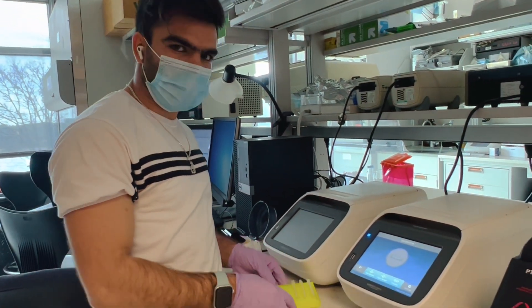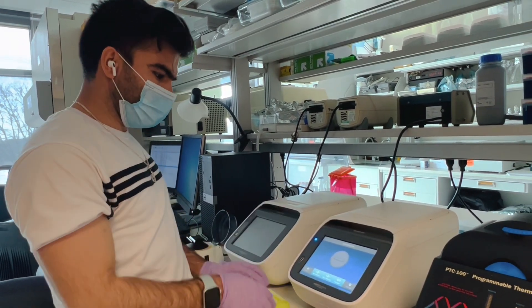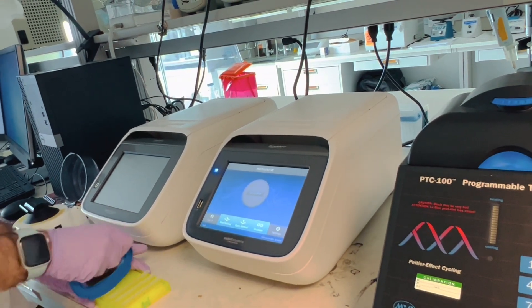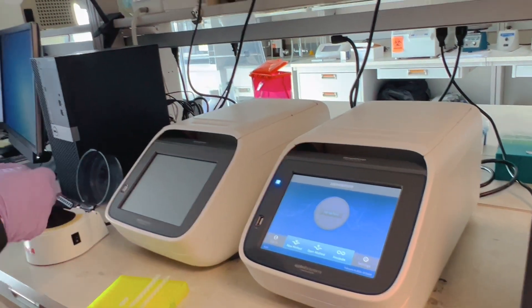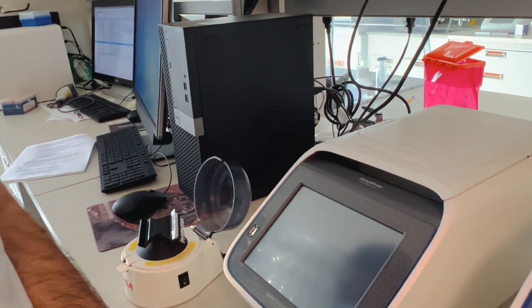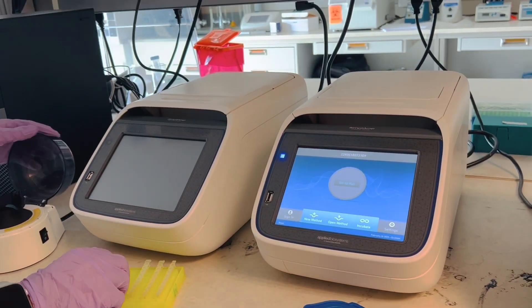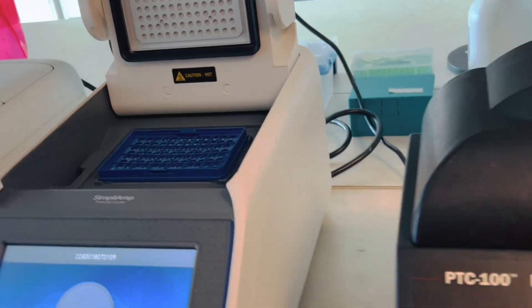The tubes have everything required for the PCR. Before putting them in the thermocycler, make sure the caps are tight enough, and spin them briefly for a couple of seconds. Now they are ready to be placed into the thermocycler — the PCR machine.